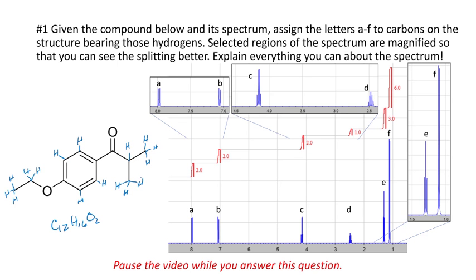Okay, and we have some groups of equivalent hydrogens: these 2 methyl groups of the isopropyl, these 2 hydrogens that are flanking the carbonyl group, these 2 hydrogens that are flanking the oxygen of the ether, the CH2 on the oxygen, and the CH3 over here. We expect to see, oh, and one more, the H of the isopropyl.